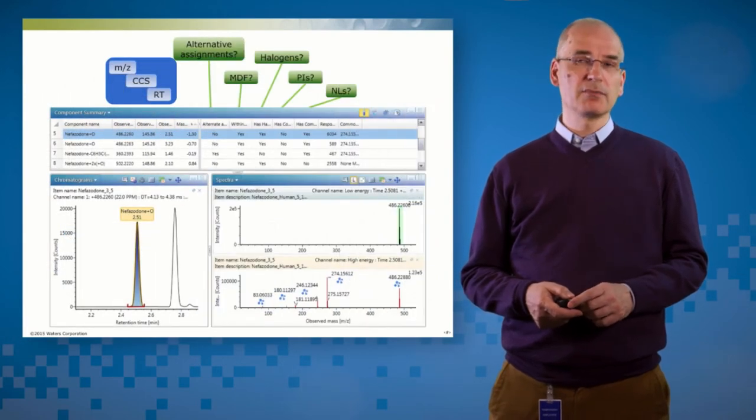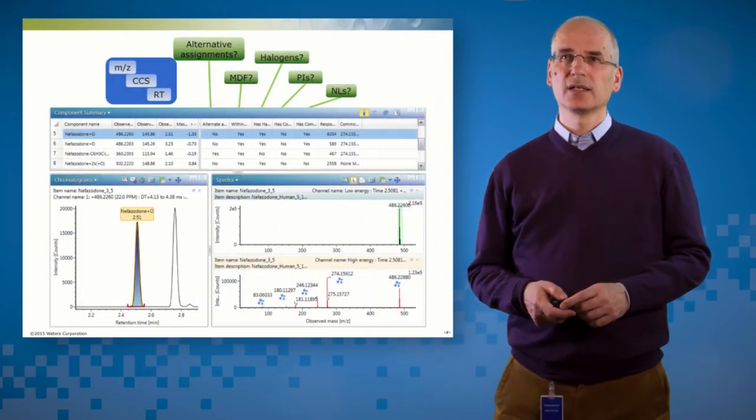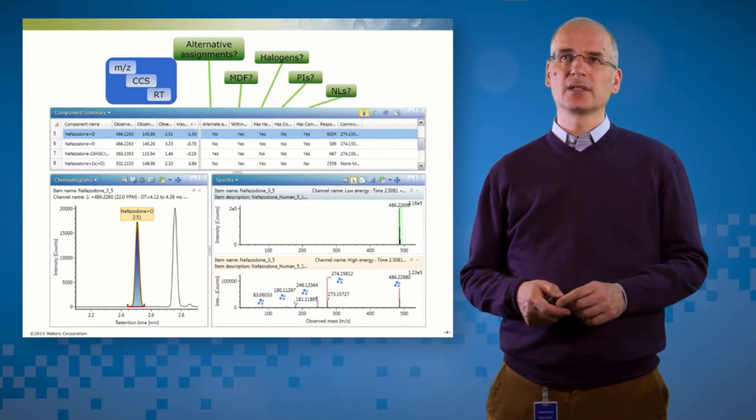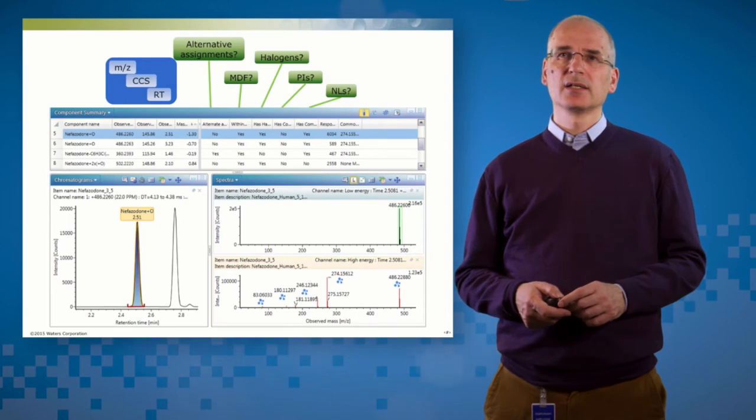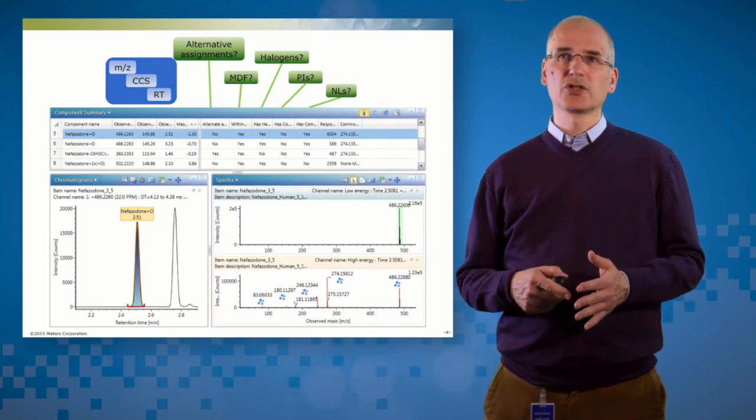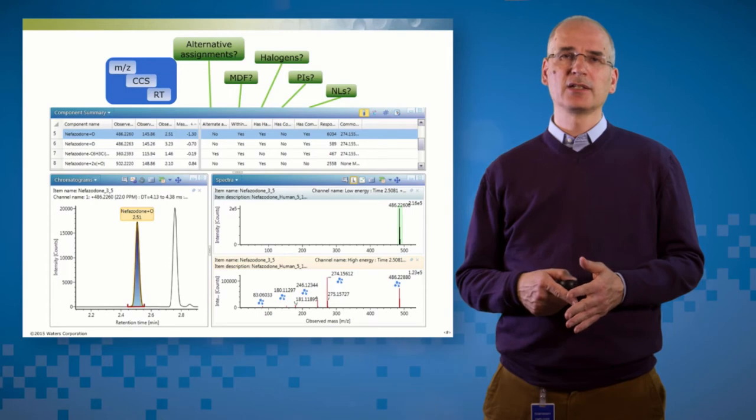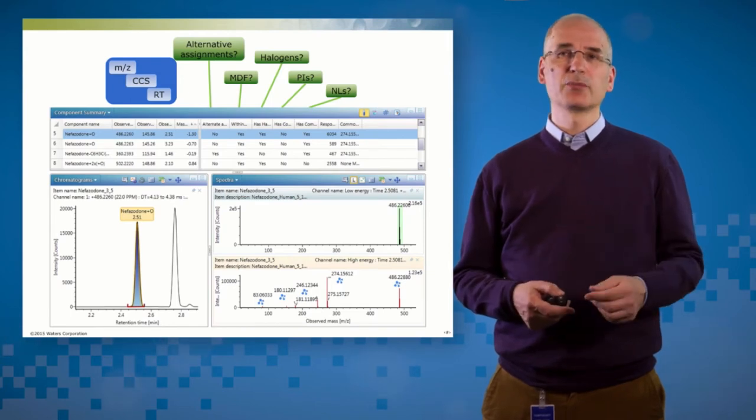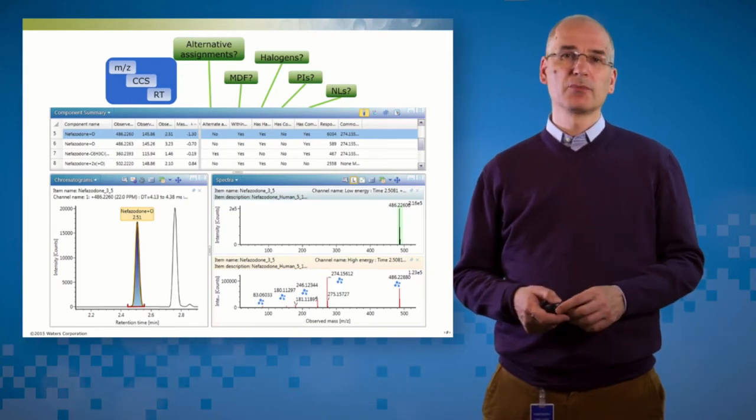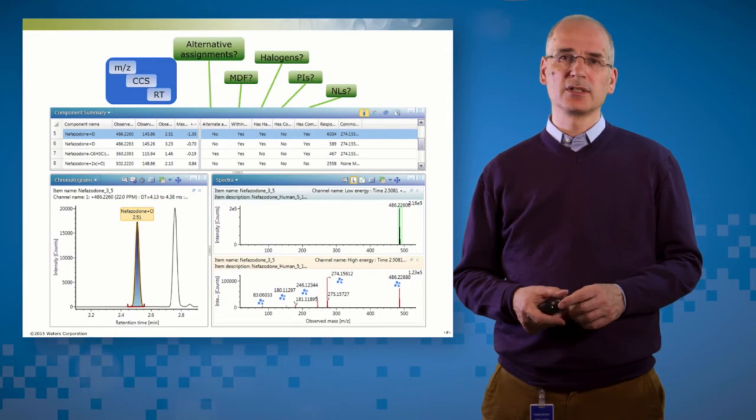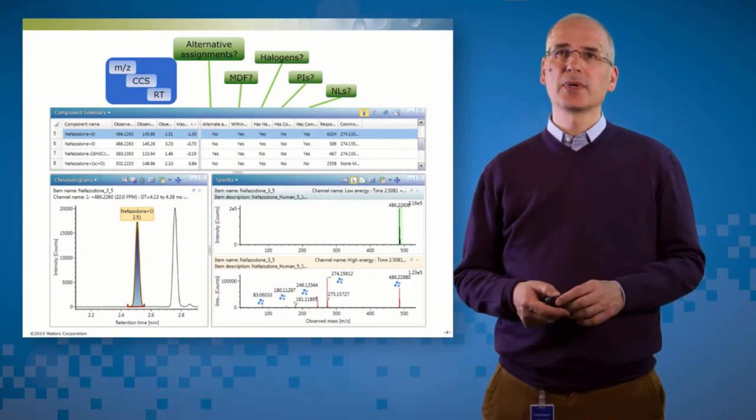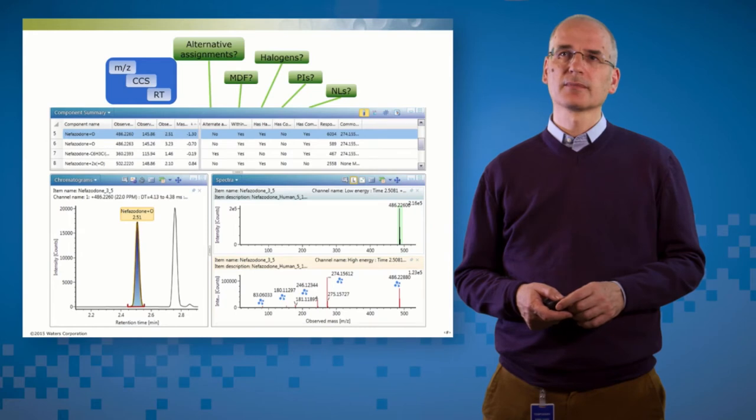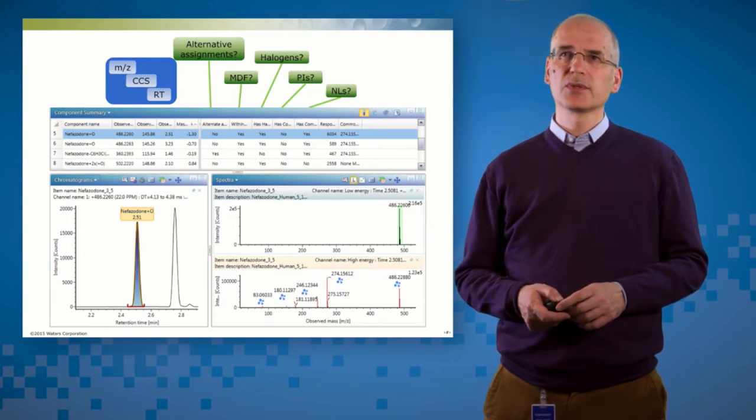So when I process the data using the method we've just created, I get this table and you can see the added value of having that information in there. The first thing is, normally we're going to get mass over charge and retention time. But on Vion and on Synapt, processed with Unify, you get an extra column. And that column is the collisional cross-section. It's there by default. The calibration is done up front. And that extra parameter that we can use to our advantage is up front and center, just as a natural part of any analysis that you have.